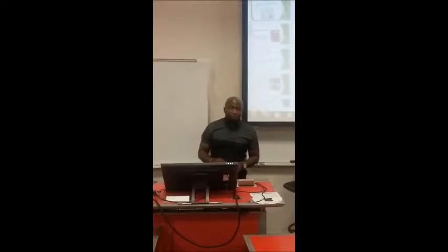Everybody, my name is Claude and my partner's name is Faraz, and today we would like to talk about one of the fluid properties called viscosity. Viscosity is a measurement of a fluid's resistance to deformation. We will learn about viscosity through two experiments, the Thomas-Stormer experiment and the Brookfield experiment.